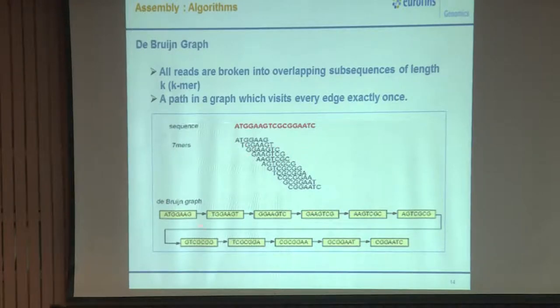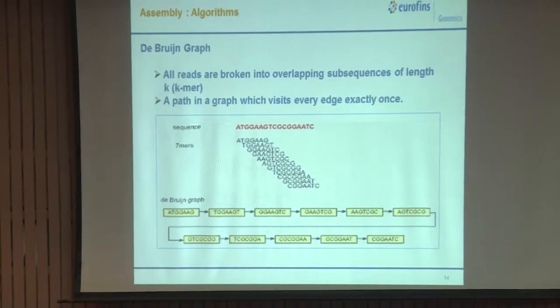Now in this, one sequence will find its overlap against the other sequences. Each and every sequence will get matched to each and every sequence of the others. Just imagine how many. This way the de Bruijn graph is created, and based on this the overlapping sequences get attached to each other, and when that happens it creates a contig, right? So this is how contigs are created using several softwares.